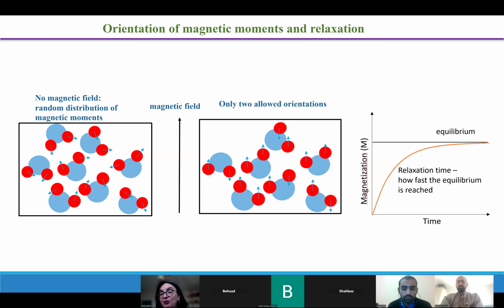Staying is a quantum state of a higher energy. And everybody and everything in the world tends to reach a minimum of energy. This is the next fundamental rule of the world. So what will happen? First, the orientation which is associated with a lower energy will be taken.